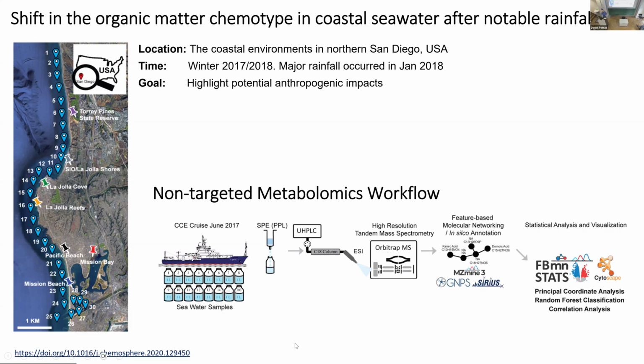Before, we then merged this data in Cytoscape, and this morning pushed it through our FBMN stats pipeline. So in our case here, the web app, but for this purpose, we also run those in our Jupyter notebooks, which give you a little bit more flexibility and more options to do that.